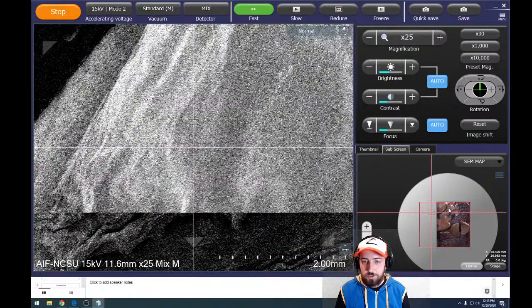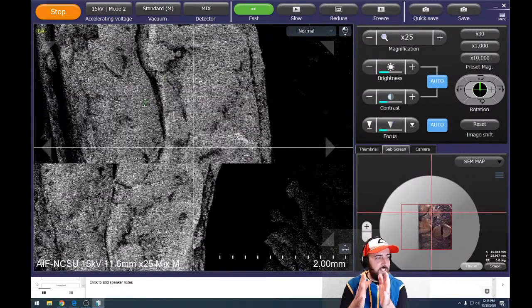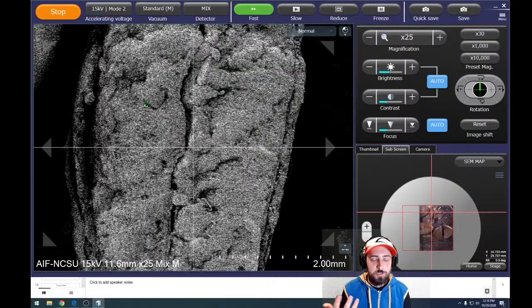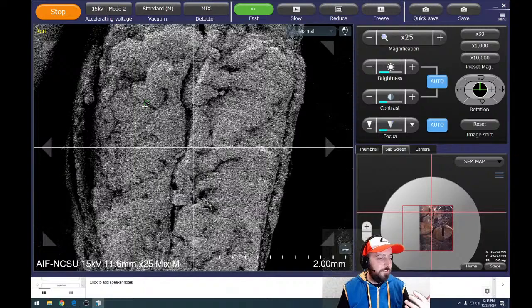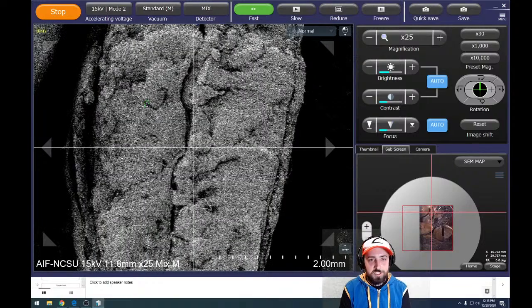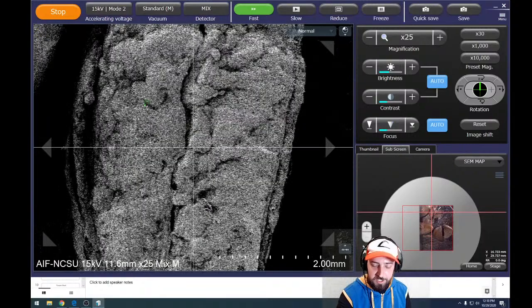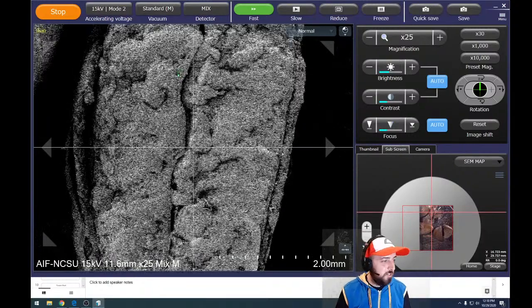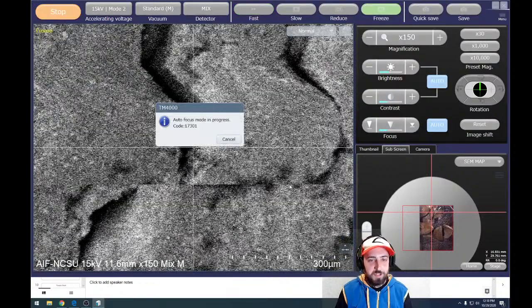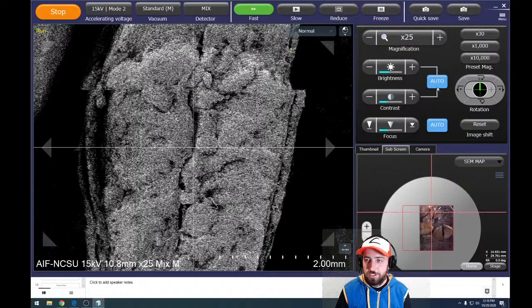So now let's go over to, similar to what I did in week 12, where I cut the seed in half and then set it upright so that we could see the inside of the seed. You have to be very careful when you are doing what's called cross-sectioning of anything you want to see on the inside, because if you just use scissors or even a razor blade and cut it in half, it can cause a lot of damage during the cutting process. So we'll keep that in mind. There are better pictures online of some of the things I'm about to show you, but I did my best job with the time I had, and I think it still turned out great.